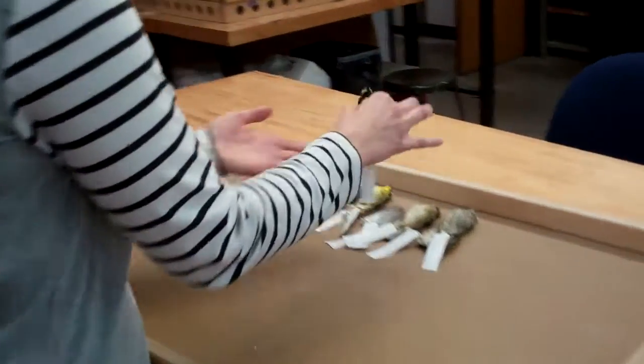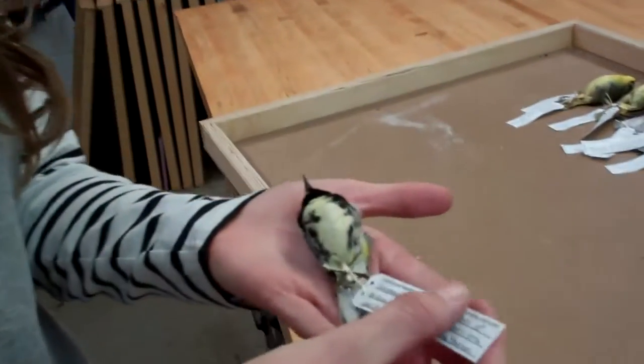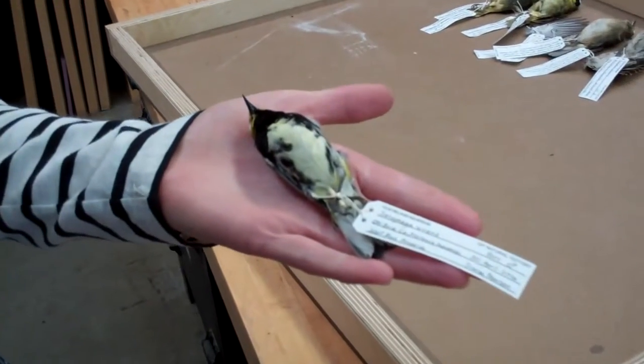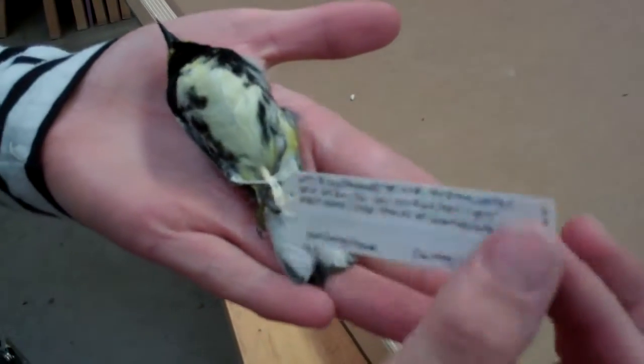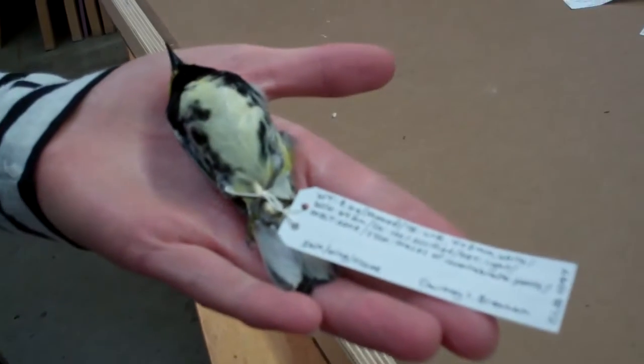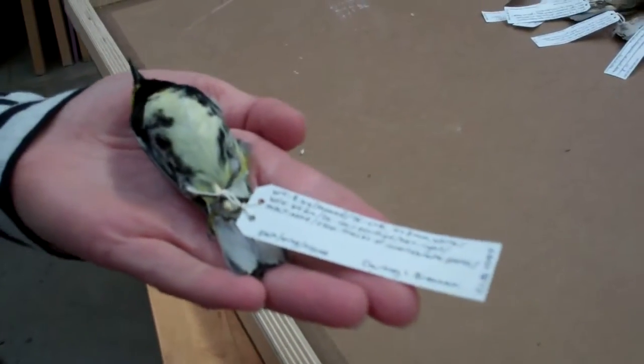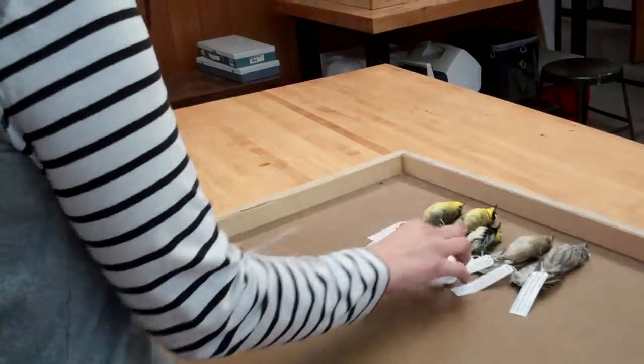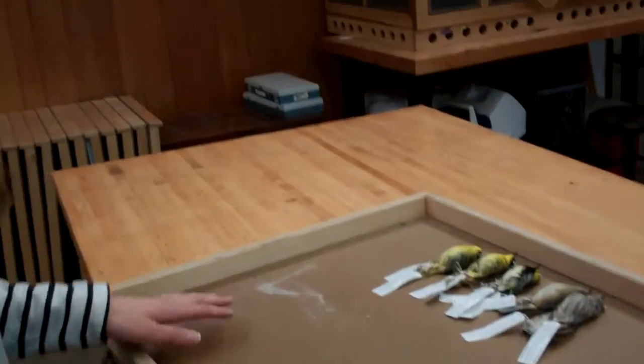Once the skin is fully dried, all of the information that our volunteers jotted down while preparing the bird is transcribed onto these data tags, and these data tags stay with the specimen forever. This information gets cataloged and digitized and is associated with this bird for the rest of its time here at the museum.